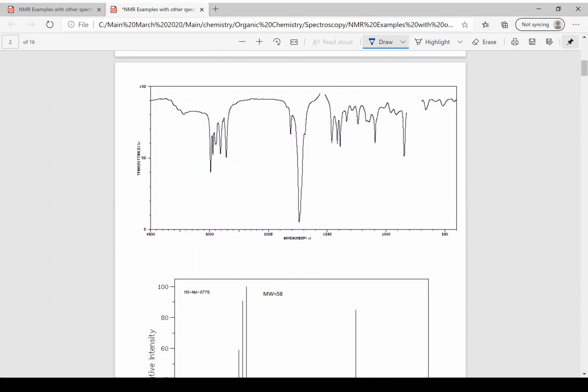How are we going to know this is an IR? Well, I hope the wave number, and I hope just the overall shape screams at you. All right, now remember on IRs, you need to draw a line around 2800. Okay, that was a bad line. And then around 1900. And then again at 1500. As you get more experienced, you won't have to draw those in.